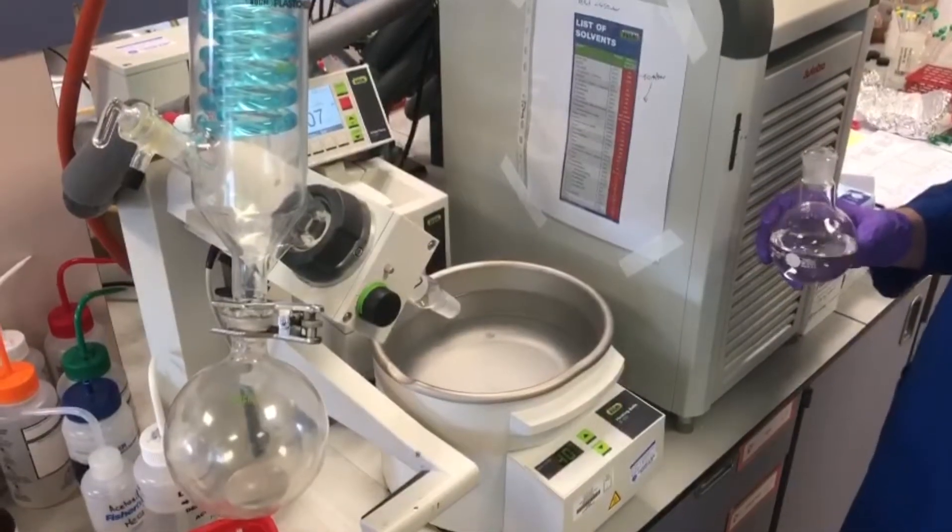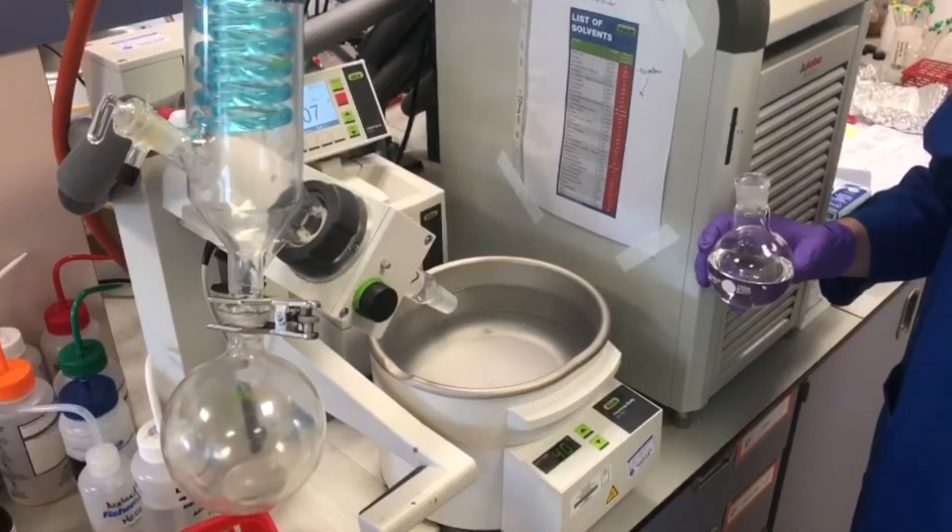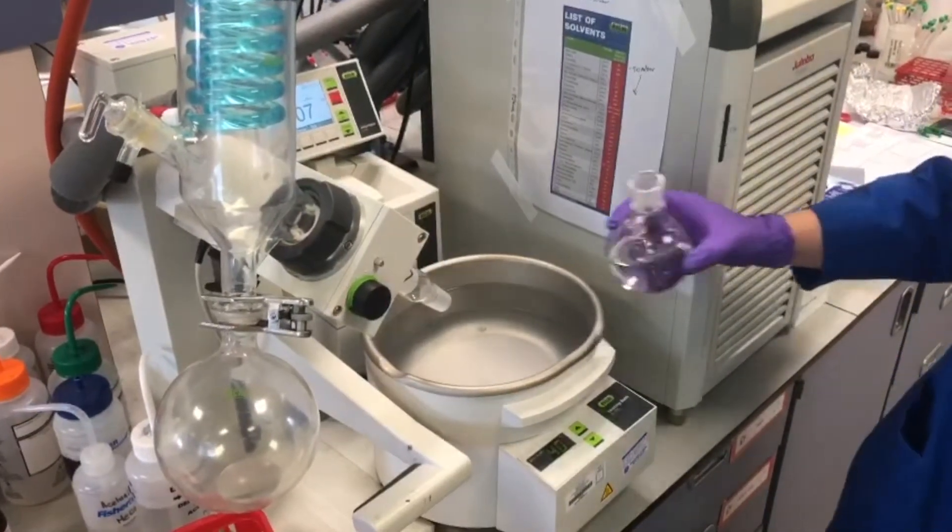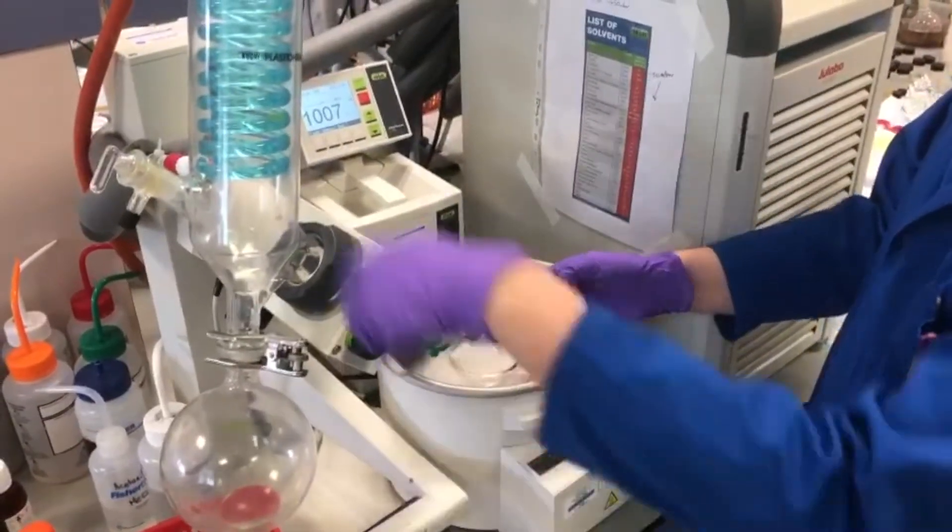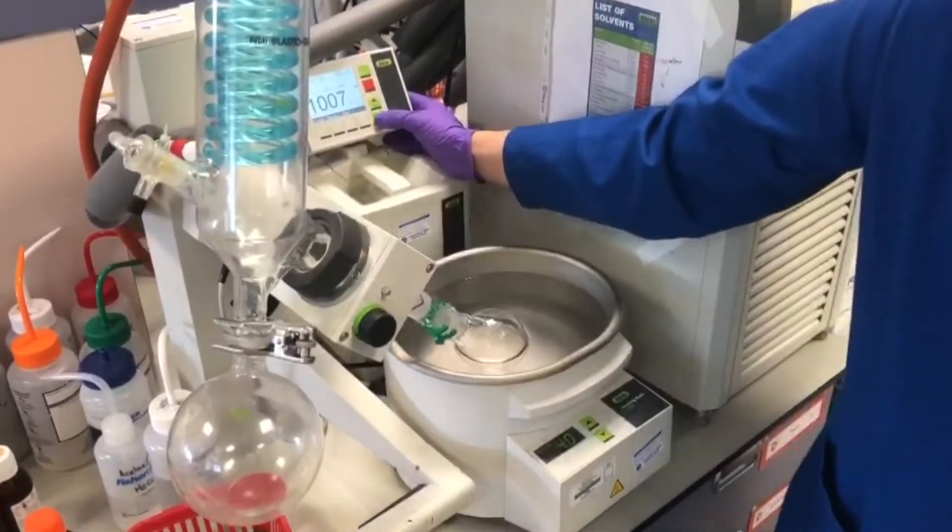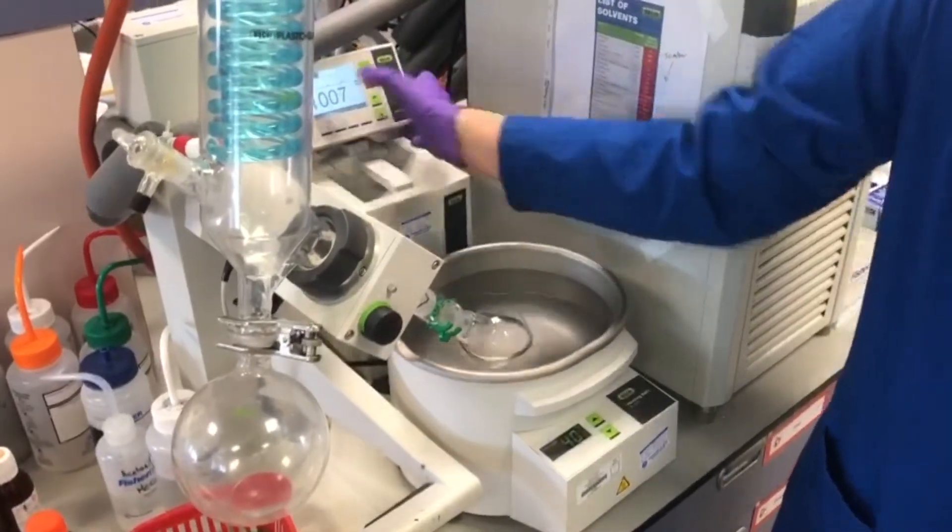Removal of formic acid is comparable to the removal of water, as they have similar boiling points. This will take a while and will need to be under full vacuum. Clip it on, throw it into the water bath. In this case we just set a low pressure, and we'll set it to continuous.